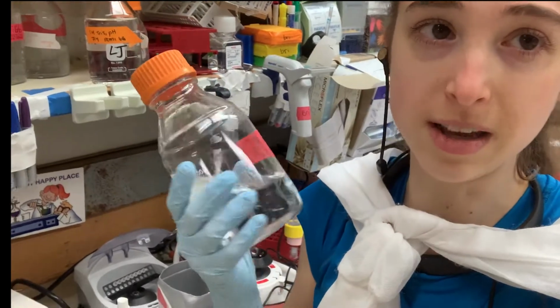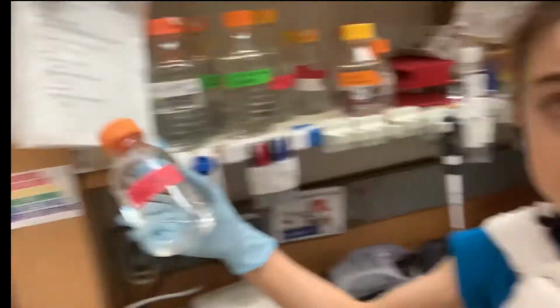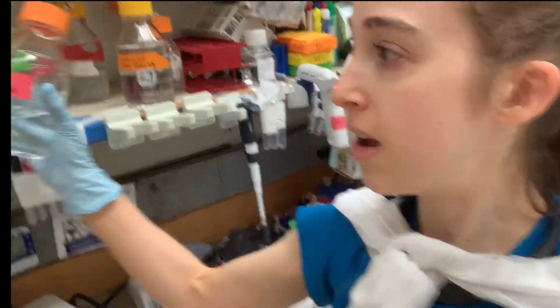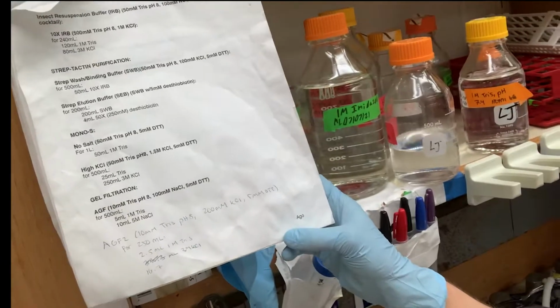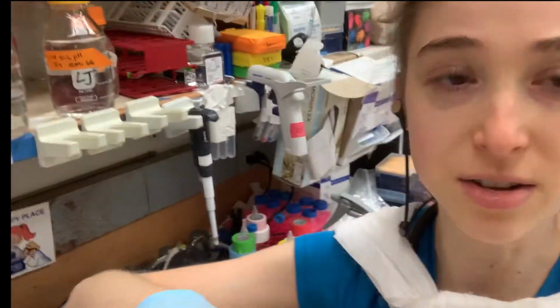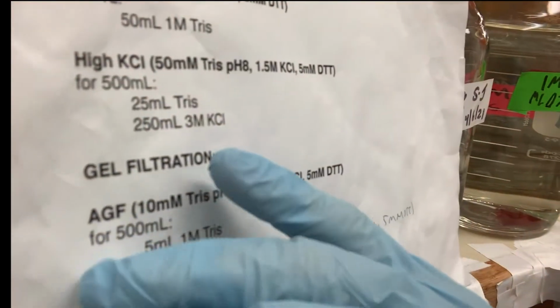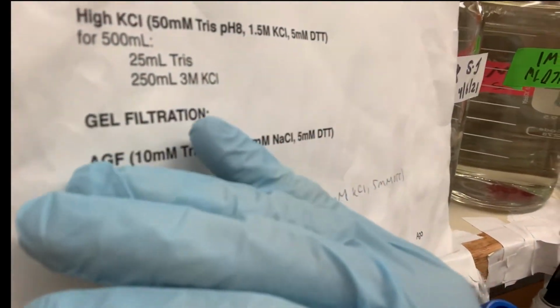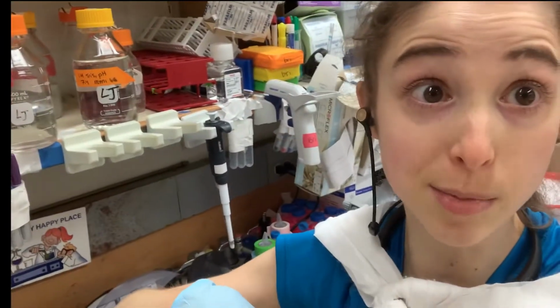So we talk about purification buffers. There are different buffers that I use at different stages in my purification. And I have my cheat sheets where I have the ingredients in those, and you can see that. So for a no salt buffer, I just add Tris. For a high KCl, I have Tris and then I have the KCl, and you can see that I'm using my stock solutions to make my working solution, the one that I'm actually going to put my protein in.